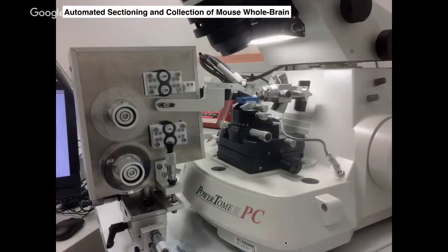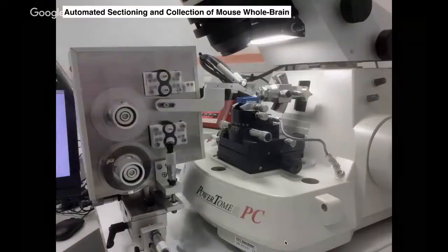Now, with the serial block face approach, I was working for quite some time with others trying to get that to work. Ultimately, or currently, it is not working. However, about 1.5 years ago, I decided to focus my attention on the serial sectioning approach. It seemed like it might be better suited for cutting through large samples.